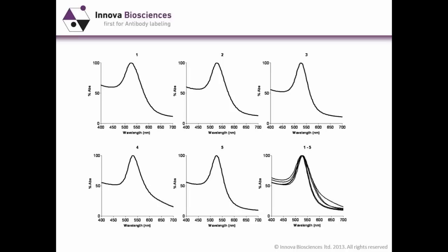Well, again, we can just look by absorbance scanning to confirm what our eye tells us, and when you see 5 profiles like this, they on the face of it look quite similar, but when you overlay the profiles you can see that there are differences.